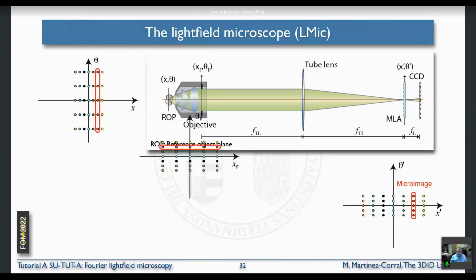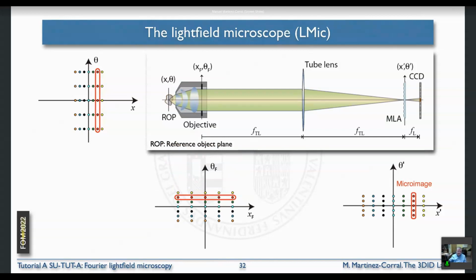And it is not difficult to find that the plenoptic map here is the same as the emitted or collected plenoptic map, but rotated by 90 degrees. Okay, not only rotation plus some scaling, but forget about this, mainly rotation. And therefore, the columns here are now rows.